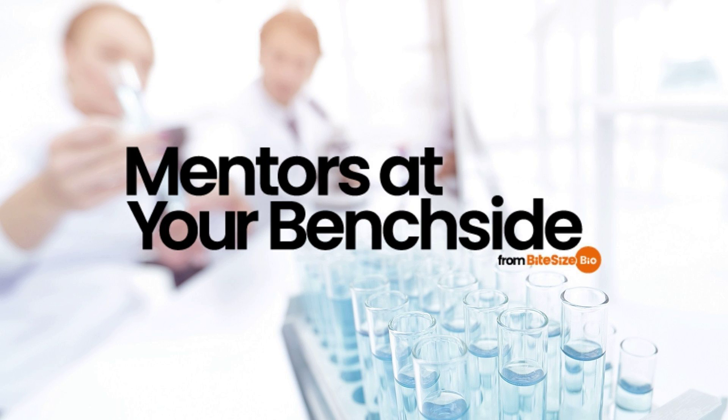At the time of recording, the smallest structure solved using cryo-EM is streptavidin, which weighs 52 kilodaltons. The average molecular mass of a bacterial protein is 40 to 50 kilodaltons, depending on species and genus. So it's reasonably clear why there's a massive effort to reduce this lower limit. Incidentally, the predicted theoretical lower limit of cryo-EM is 38 kilodaltons. The reasons are much too complicated to get into here, but have to do with the difficulty in obtaining high-quality information from non-crystalline material. Check out the references in the corresponding online article if you fancy a deep dive.